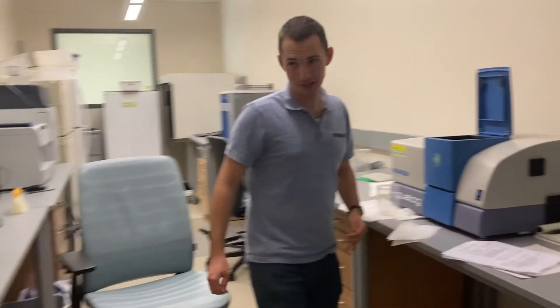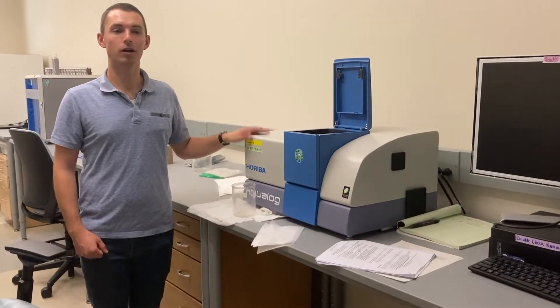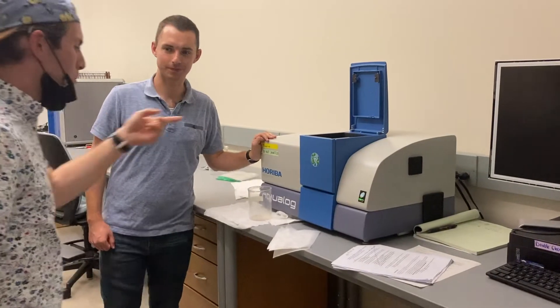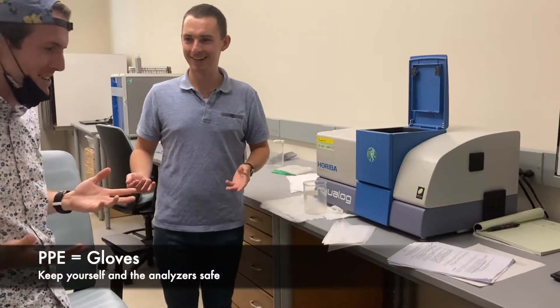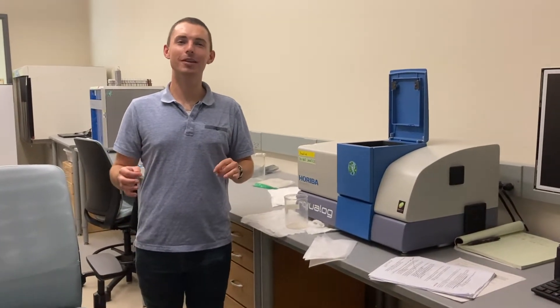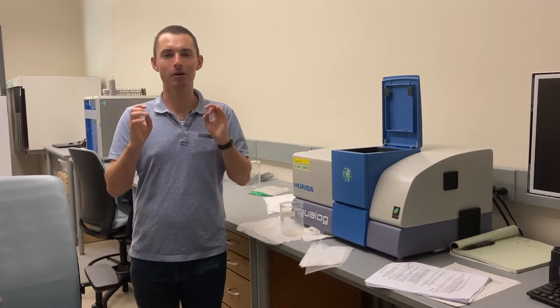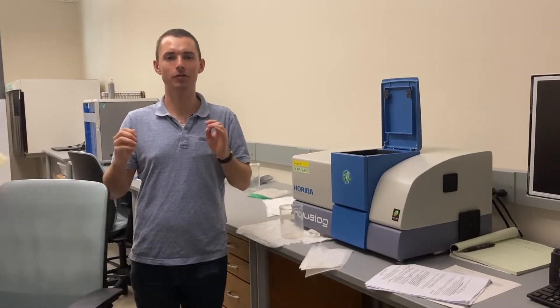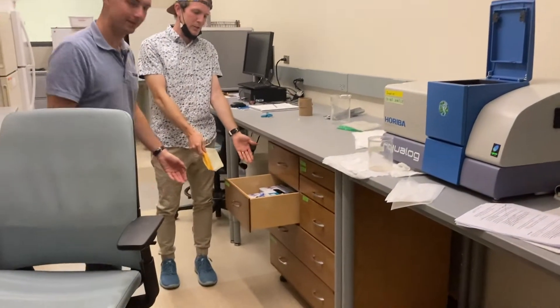So here's some of our analyzers. Over here, this is called the Aqualog — it measures absorbance within the water. Oh yeah, I was working on that earlier today. Hey, whoa — where are your gloves? Oh yeah, forgot again. It's important that when you run any of the analyzers, you're wearing gloves. We want to keep all of our samples clean and free of contamination. You can find gloves in this drawer in the clean room.